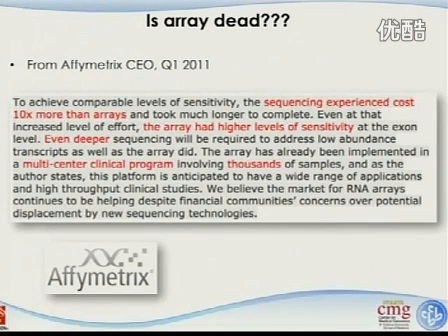Yes. So you also mentioned the targeted sequencing. So Jake is asking about the targeted sequencing. Actually, targeted sequencing is on the DNA sequencing. So it's not really trying to measure the gene expression level. It's trying to identify the genetic variations in the exons. It's not the RNA part of it.